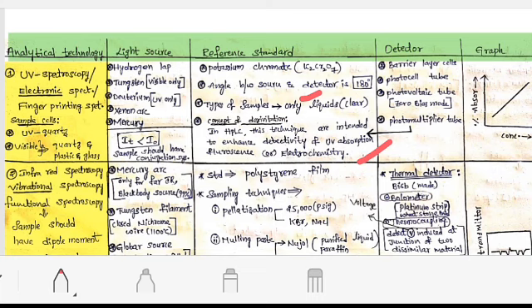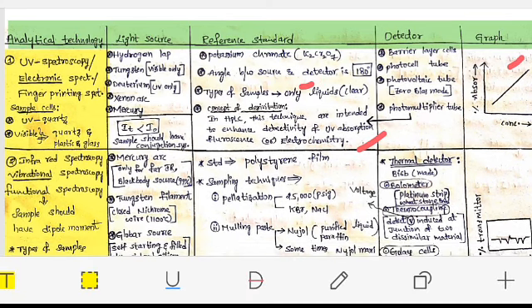Let us go to IR spectroscopy. IR spectroscopy is also called vibrational spectroscopy because the bond is going to vibrate when IR light is used. This is also called functional spectroscopy because by using IR spectroscopy we can determine the type of functional group present.